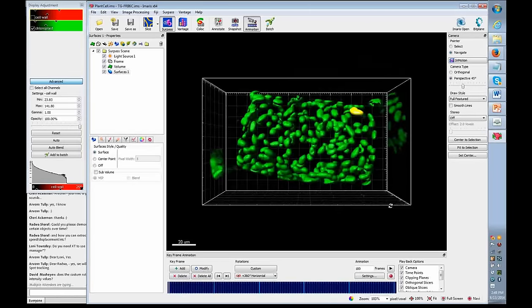So if you want it relative to 0, first click 100% and set the zoom where you want it. Then do your custom rotation of however many degrees, and it's going to rotate relative to the earlier position. So if I want to go another 10 degrees and get to 55, I could do that here by typing in 10. And I get another keyframe that's rotated a little bit further.